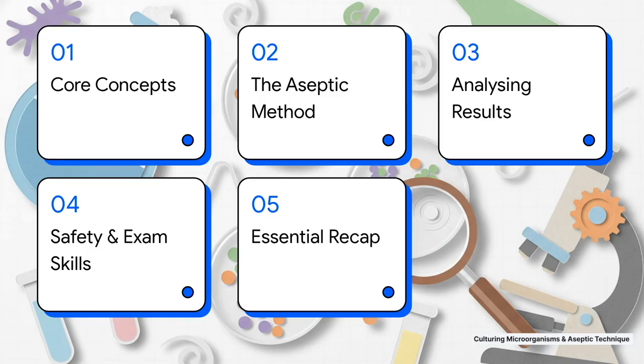Then we'll walk through the all-important aseptic method. After that, we'll get into analyzing your results, cover those crucial safety tips and exam skills, and finish up with a super quick recap. Right, let's get into it.